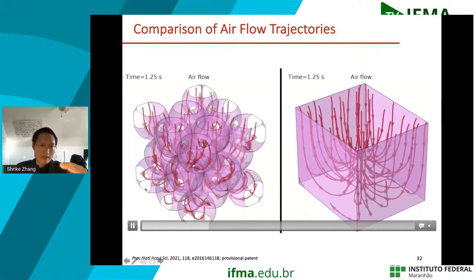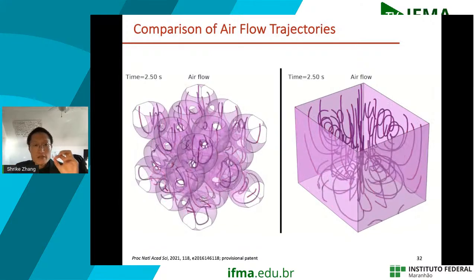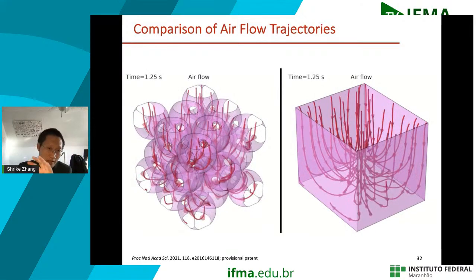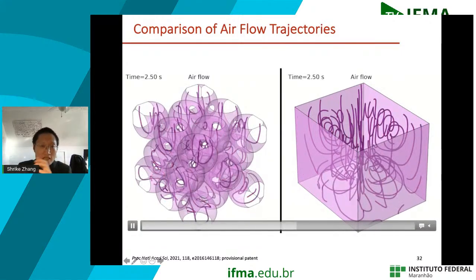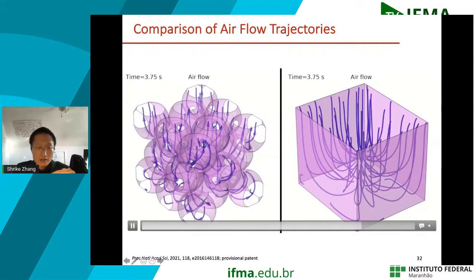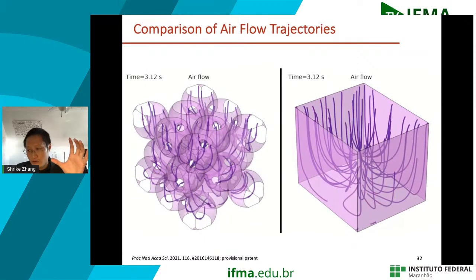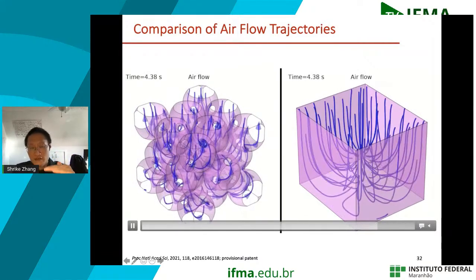But if you have our device, a three-dimensional scaffolding system in the chip, you can breathe them. The air trajectories become much more physiologically relevant because when the air or particles come in, they actually hit the wall, and depending on where they are, they can sometimes go through these windows connecting the different sacs. That's very important because there's a layer-dependent effect, right? Depending on how close these sacs are to the inlet, there are going to be many different air flow trajectory changes in there. That's not possible with conventional flat surfaces.